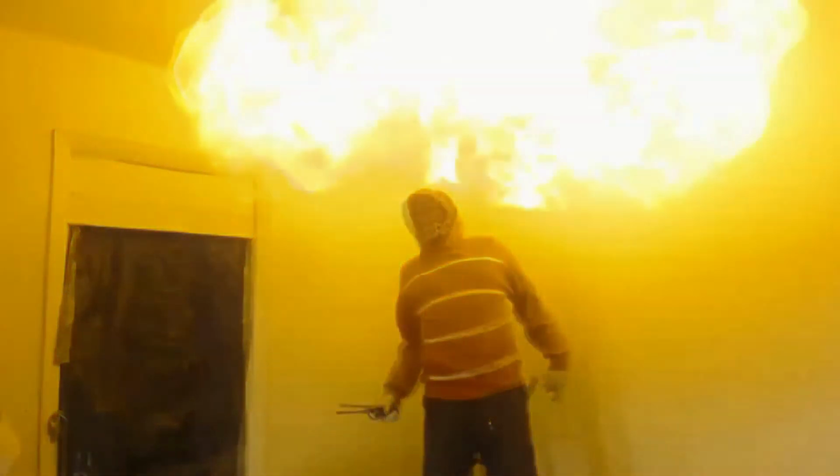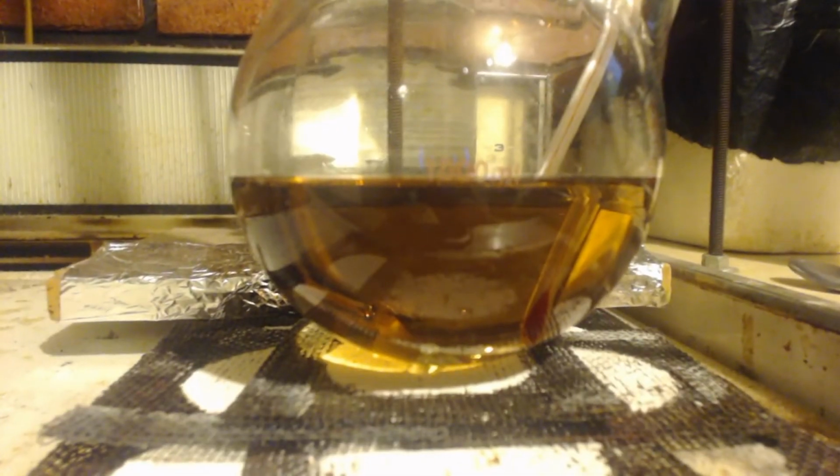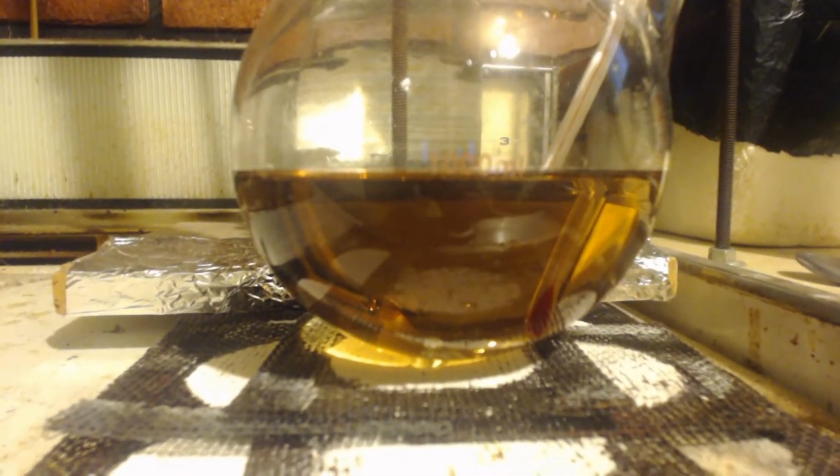This is not an instructional video. It is just a vlog showing a video account of some chemistry experiments I have done or am learning about. I do not go over all safety concerns, so if you repeat anything in the video, you do it at your own risk. This is part 2 of sodium ethyl sulfate synthesis.